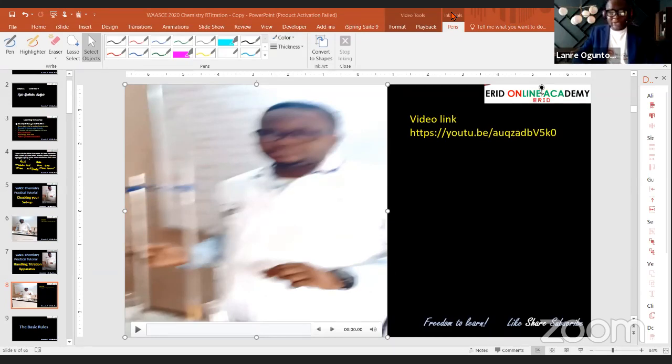The truth about WAEC and titration is that every school will have a different titre value. Okay, your titre value should be the same within your school. Okay, because your teacher will do a certain titre value that they will send to WAEC, and it is that titre value that they will use to compare with your own results. Please, it's very important that you are as accurate as possible.